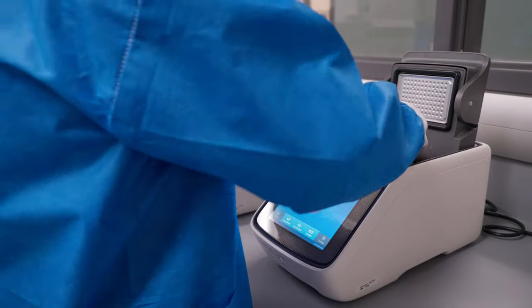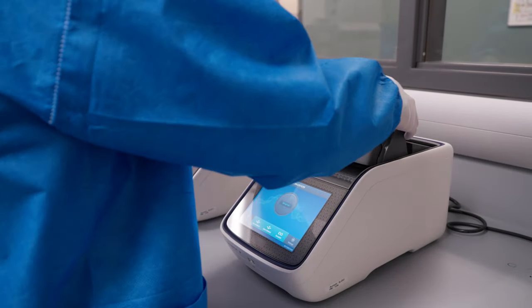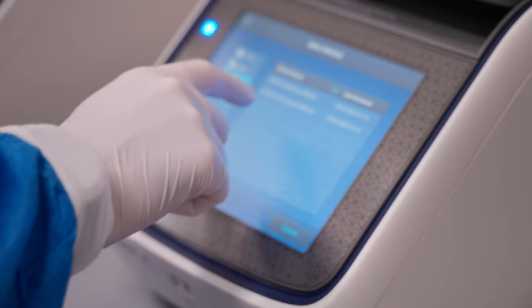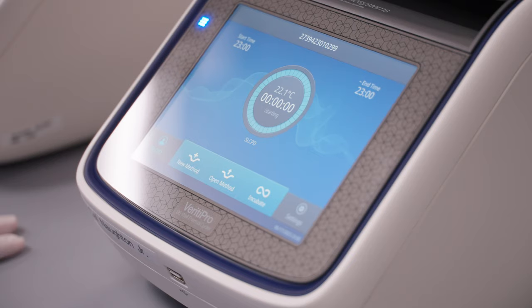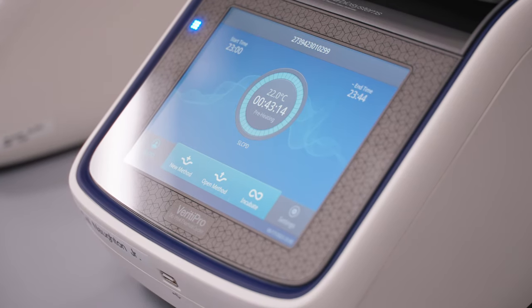The instrument used to perform the PCR process is called a thermocycler. It contains an extremely precise heat block that raises and lowers the temperature of the samples at specific times. During this process, the DNA is heated to near boiling temperatures.